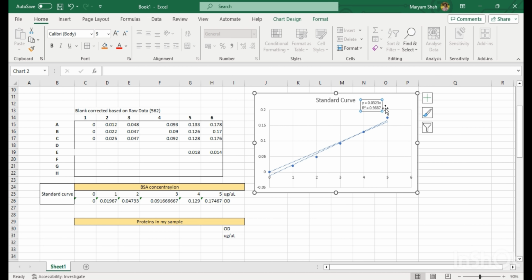So usually this value is a percentage which shows you how much the two variables are correlated. Usually if your value is more than 95%, it is really good, but I'm lucky because I got about 98% here, but I think it is almost 99%. So okay, I'm happy for that.